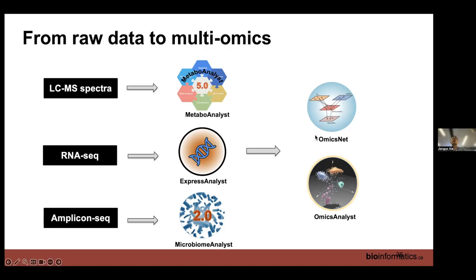And now we can annotate and put them together using OmicsNet, which is knowledge-based, network-based integration, and Omics Analyst, which is data-driven. Basically we use some dimensionality reduction to put them together and show the common patterns.